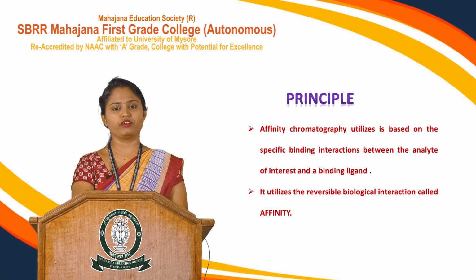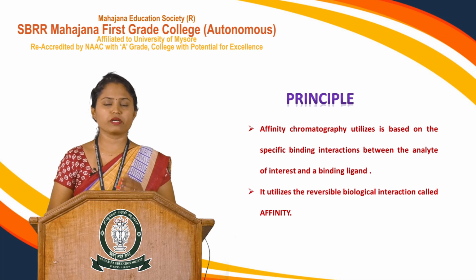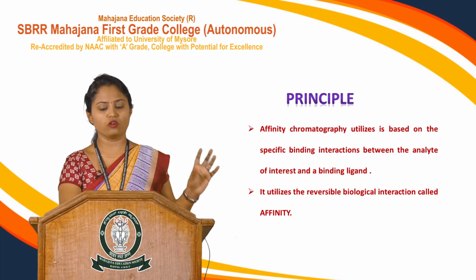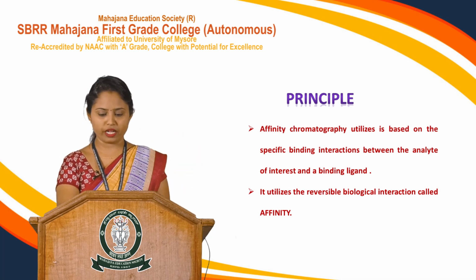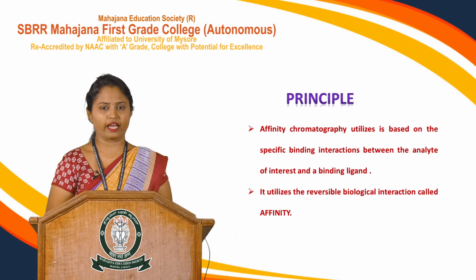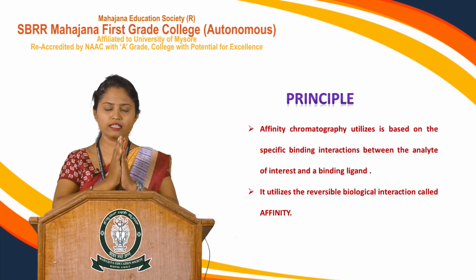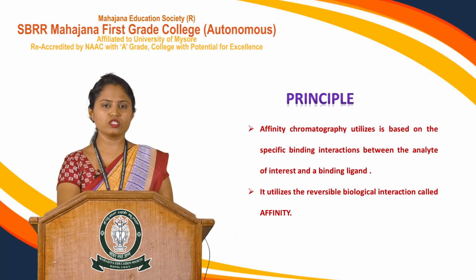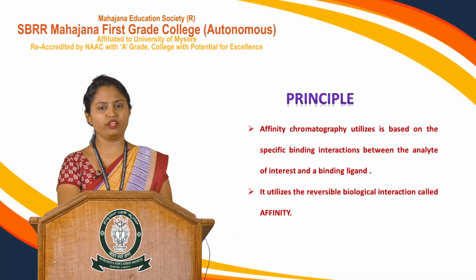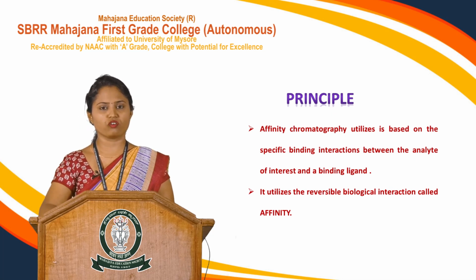As I already mentioned, affinity chromatography is a liquid chromatography which works based on specific interactions. It works on the specific binding of a target molecule, or analyte of interest that you need to separate or isolate, to a ligand, utilizing the reversible binding of the ligand via affinity. Specifically interacting molecules will bind to the ligands and be retained in the column. The molecules which do not have affinity for the specific ligands elute out of the column. Elute is nothing but passing out of the column.